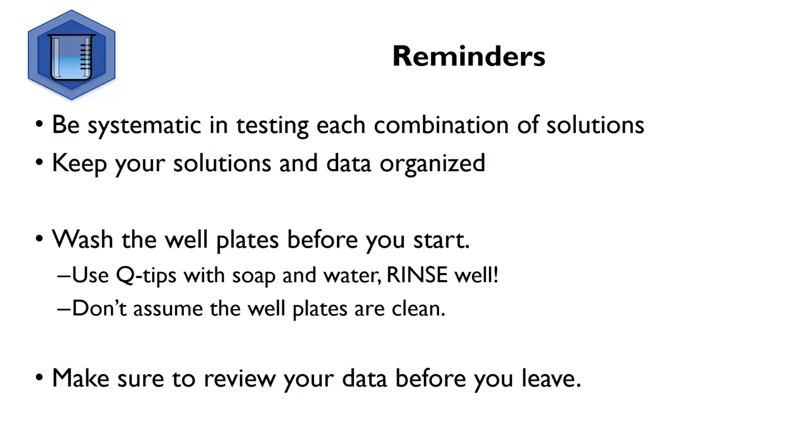Make sure you are washing the well plates before you start. It's a good laboratory practice to never assume the well plates or any glassware is clean in the lab. Always wash your equipment before you start. For the well plates, you'll want to use a Q-tip and soap and water to get each well nice and clean and scrub them down before you start and after you finish.